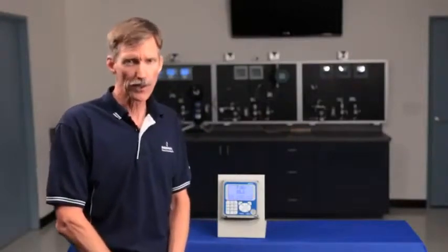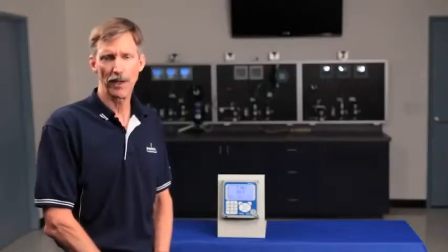The Model 56 is designed to help start-up for technicians and to minimize tech errors that might occur during installation. There are no complex menu structures, no hard-to-access wiring points, and in fact, no need for a user manual.